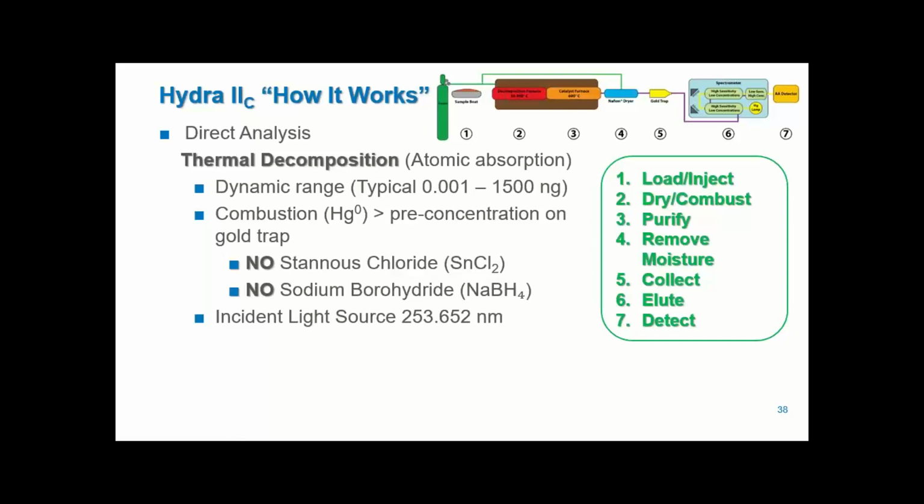The combustion takes care of all of that. So no stannous chloride, no sodium borohydride. And our incident light source is the same, 253.652. And it works in 7 steps.